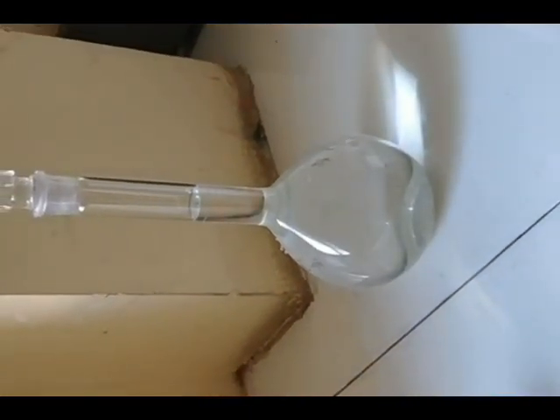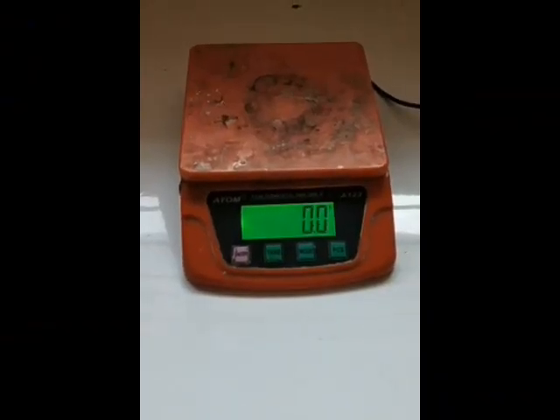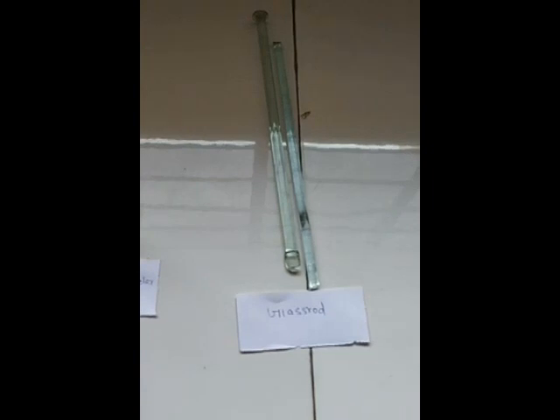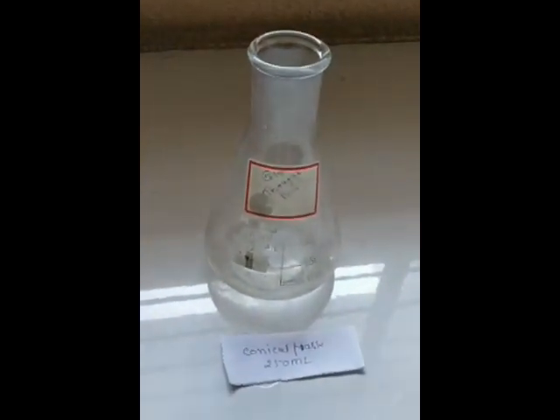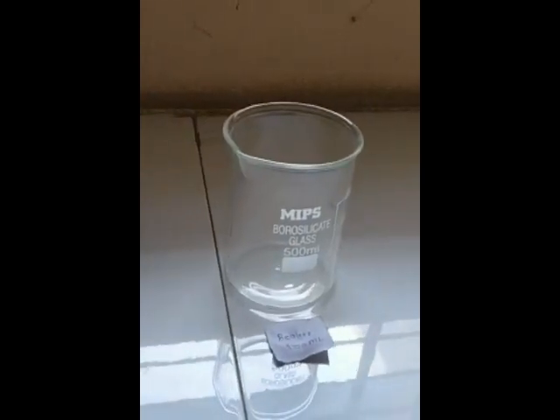The glassware required in this practical includes a digital balance for weighing chemicals, a glass rod for trituration and stirring, measuring cylinders of 10 ml and 100 ml, a conical flask, a 500 ml beaker, and a water bath for heating.